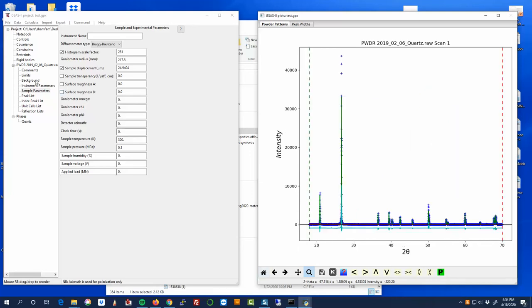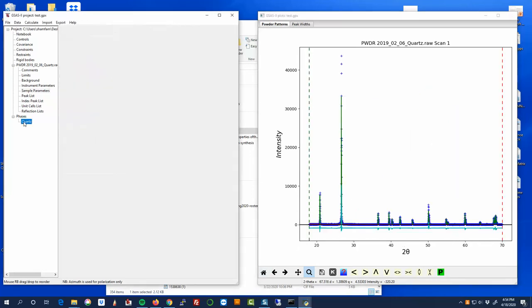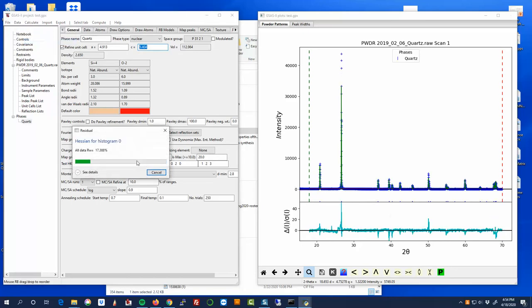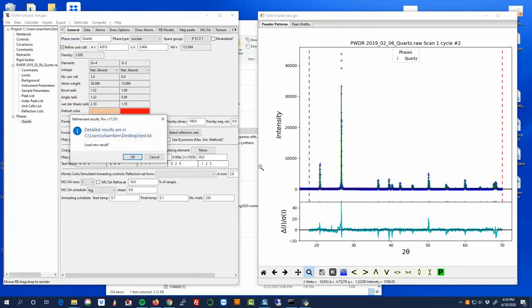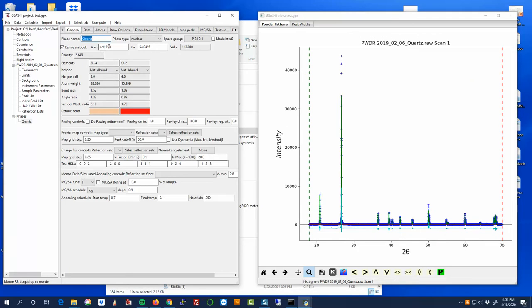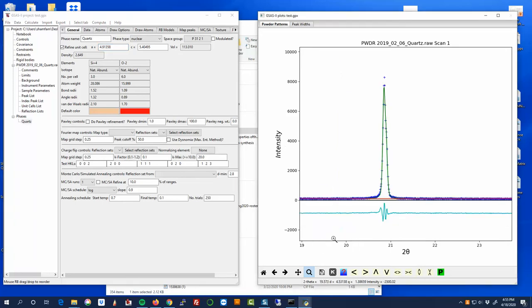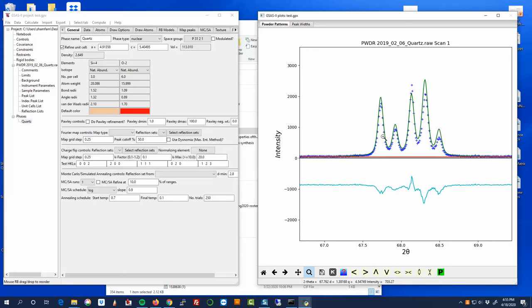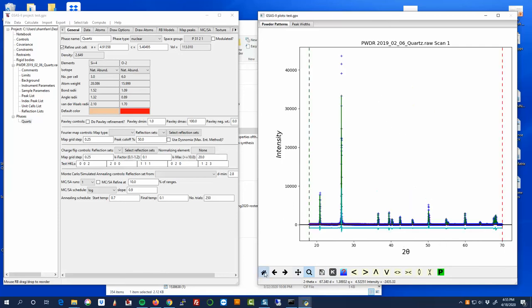But I can go ahead and come back in here and in the phase, turn on refine unit cell, because now this is going to allow these A and C lattice parameters to vary a little bit. And that should get us even closer. And so I can see these numbers have changed a little bit. I basically added some things out here on the fourth and fifth decimal place, but it didn't change too much. Again, if I zoom in on a peak, you always want to come back and look at the actual peaks themselves, because that's what's telling you what to do next. So I don't have that just up and down signal anymore. Now I have something that kind of looks like a W, down, up, down, up. And if I zoom in here, I'm kind of seeing the same thing. Some of these peaks are high, some of these peaks are low.